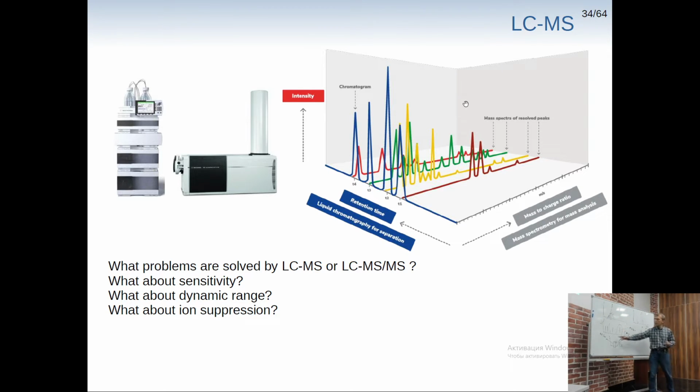Also, you will have a little bit different composition of water, a little bit different contamination, and so on and so on. And this data-dependent acquisition has one major drawback. It is not repeatable. Yes, you will get almost the same set of proteins, but it's almost not the same, and also it's hard to quantify your protein of interest because you fragmented in different positions, right?